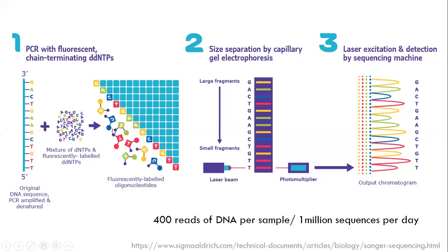And then by doing so, you generate a clonal population, or clones of multiple varied lengths of the same template DNA. You may get, for example, 1,000 copies of the same template with different lengths like this, 1,000 or 500 combinations. Then the software can detect it. It can go into a stitching process, or a consensus can be established. At the end, going through all the copies multiple times, you can say that yes, it is a 13 base nucleotide length, the first nucleotide is G, and the last nucleotide is T. That is the fundamental concept of Sanger sequencing.